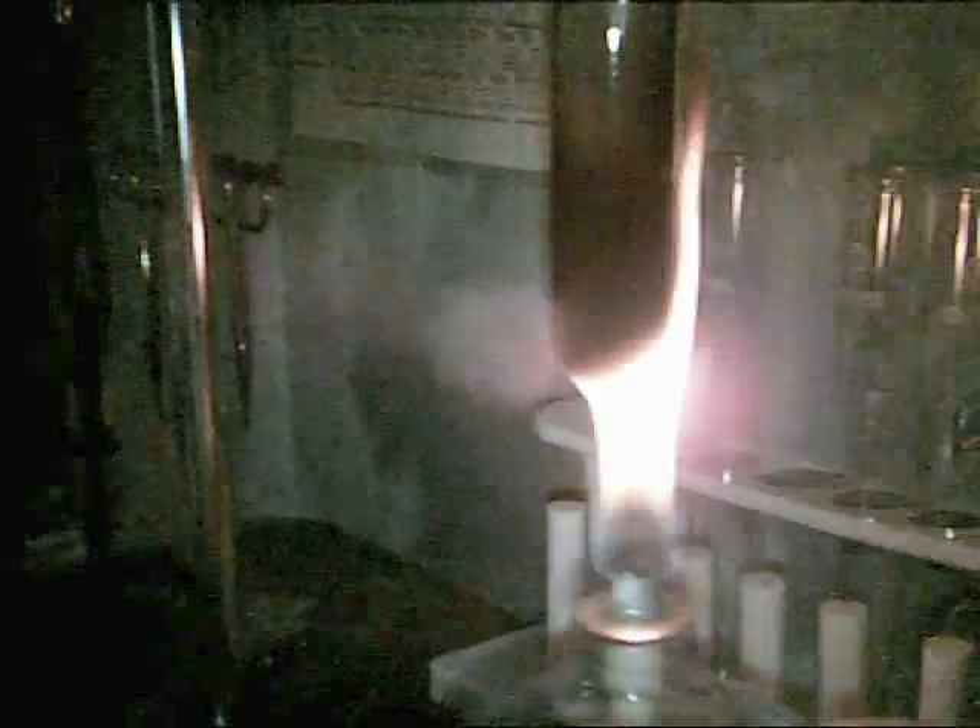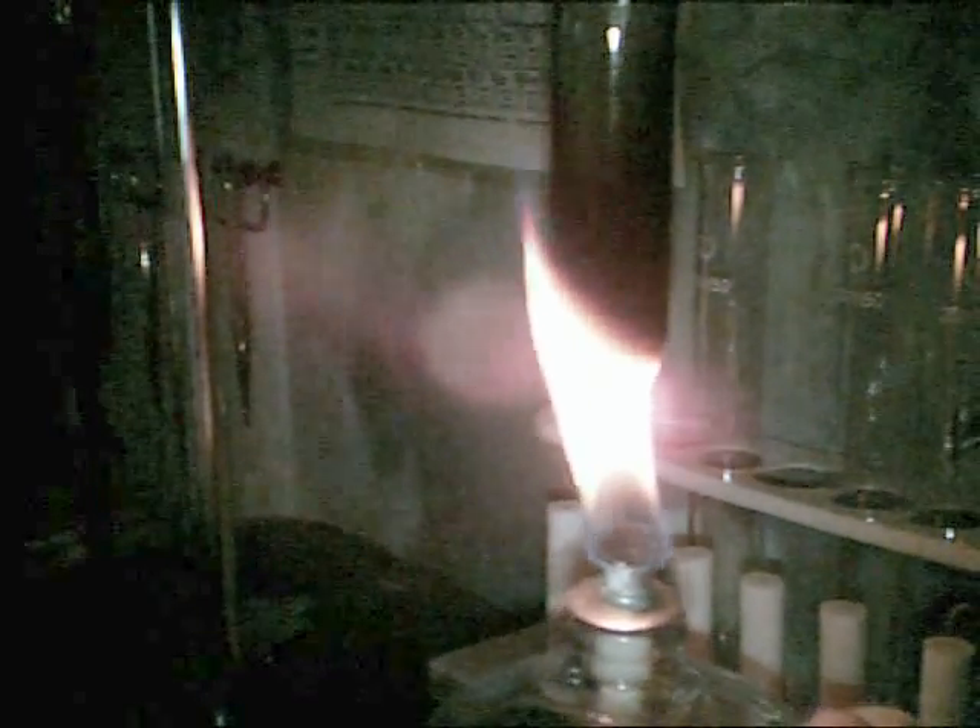Always remember to wear goggles while doing this experiment. It's off camera, but I'm wearing goggles. So just leave that for just a moment — boiling it, allowing the hydrogen peroxide to stay in the mixture while the water boils off.